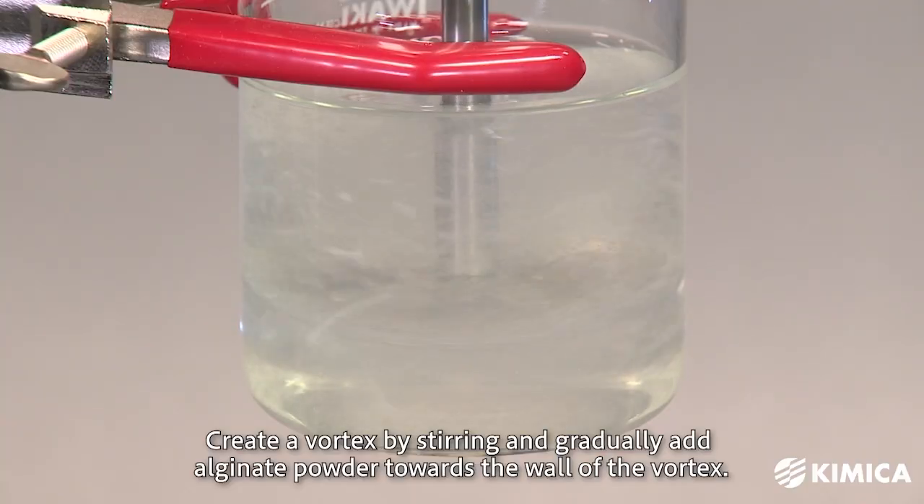If you have a stirrer available, begin by vigorously stirring the water to create a vortex. Gradually add the alginate powder toward the walls of the vortex. By doing this, the alginate powder will disperse into the water without forming clumps, allowing for quick dissolution in a short period.